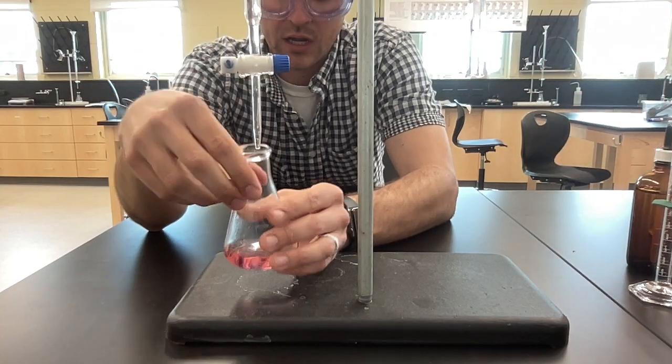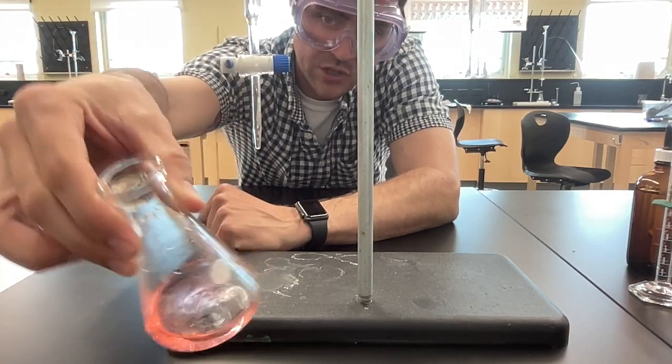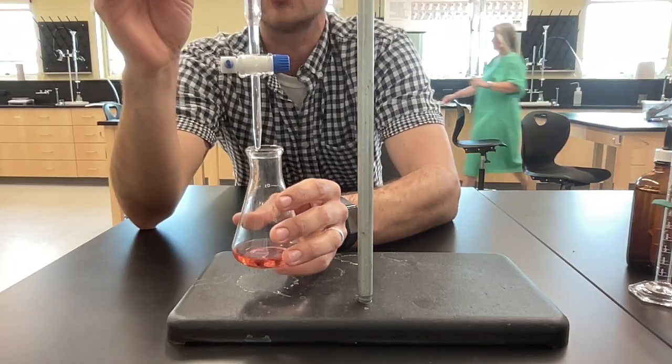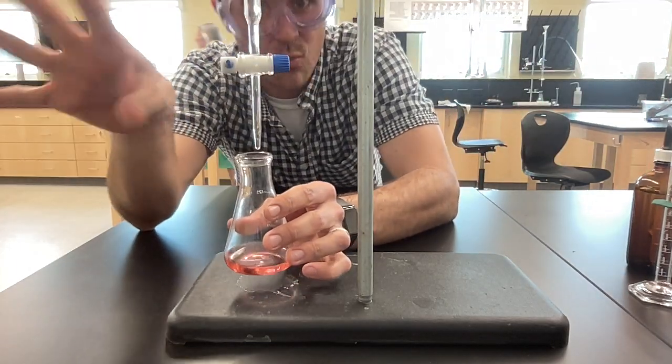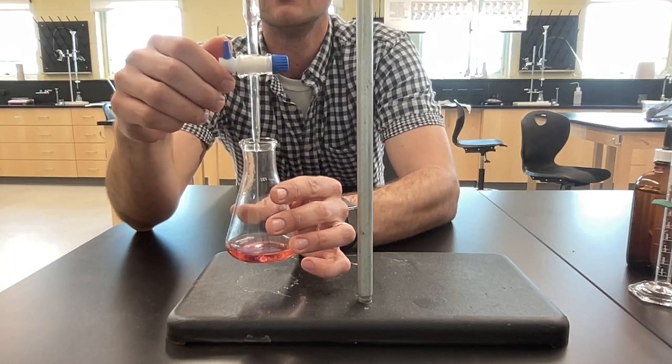Stop it there. Let's look at it now. It was kind of changing colors, but I give it a quick swirl, and it's back to reddish pink. I've added a total of 7, so if you guessed somewhere less than 7 for how much I had to add, you're wrong.